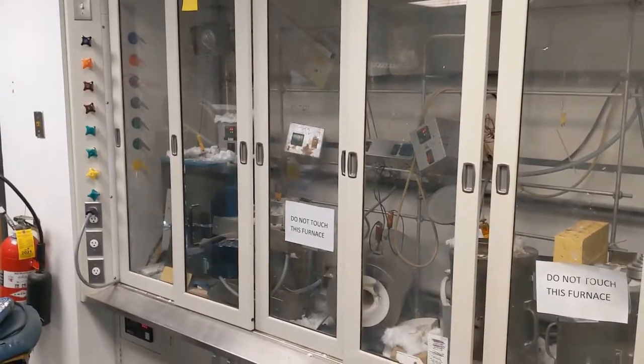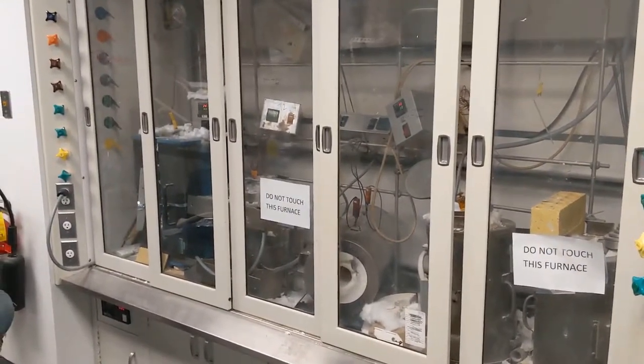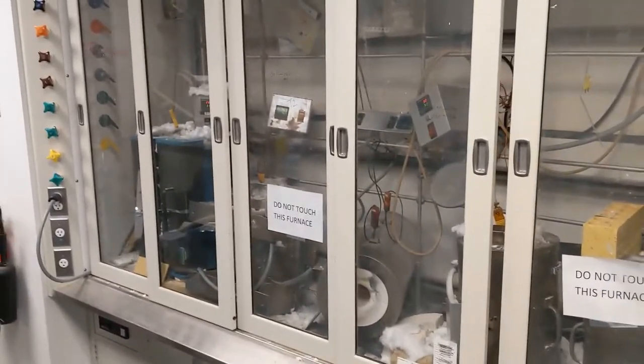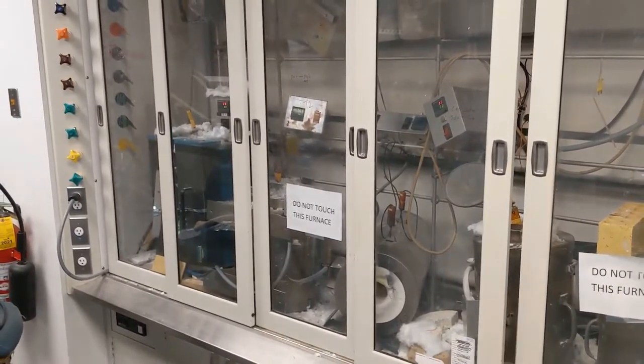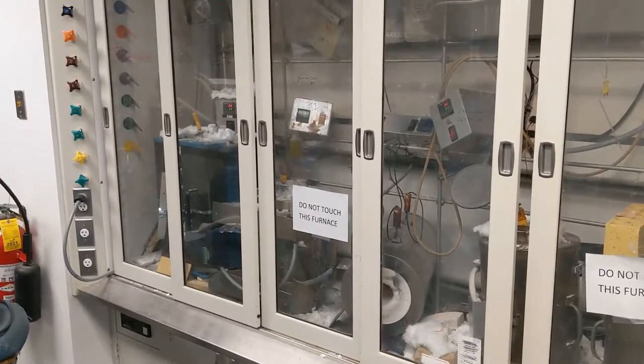Speaking of having a wide variety of materials to work with, we also have certain designated areas if you're interested in toxic chemicals. Specifically, if you're working with materials such as mercury, arsenic, or thallium, we have designated furnaces and fume hoods for those kinds of reactions.